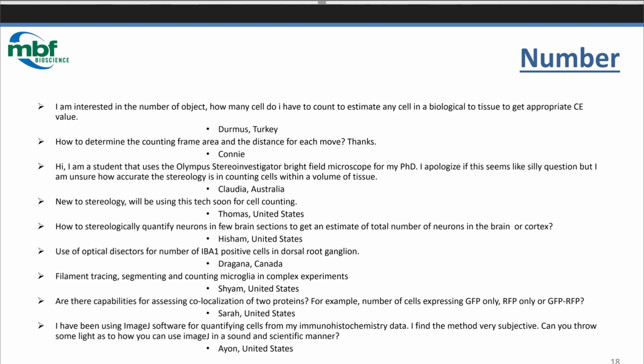I'm going to just take a look at these questions coming in. Okay, this is from Chloe Page. This is a good question about coefficient of error. In the outputs of your program, there are 2 reports of CE. Which one should I use? What is the max acceptable CE? So I think when you're saying there's 2 CEs, you're talking about the Gunderson CE, and there's 2 given, M equals 0 and M equals 1. One is more stringent than the other. If you're in doubt, just look at the higher CE.